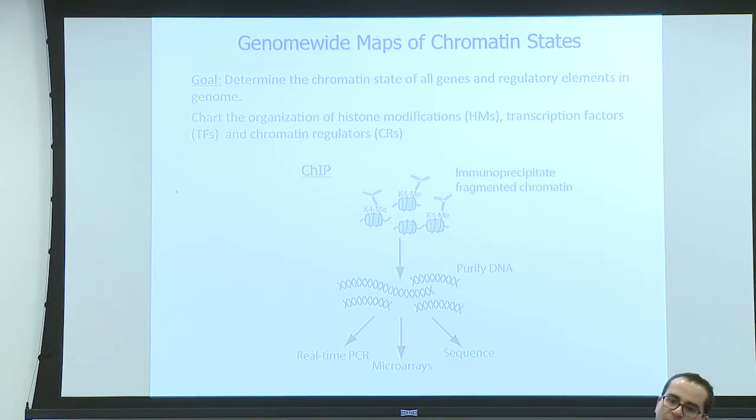But if I want to compare different conditions, I would want for every time, every batch of cross-linked and biological material, I would want the whole cell extract, because the conditions differ. So I want as good of a reference point as I can. And the idea is that the control should not be enriched. In general, we do see biases even in the control, and I think that that's one of the things that you can do using the data that I gave you, because it does have a control.